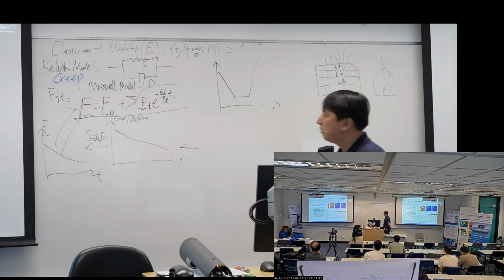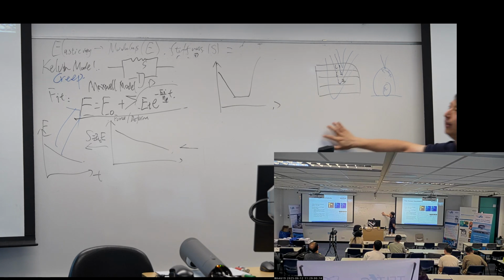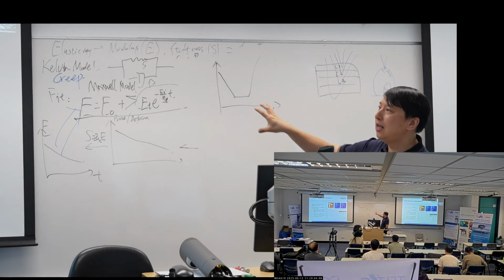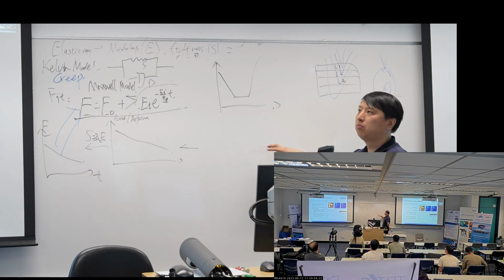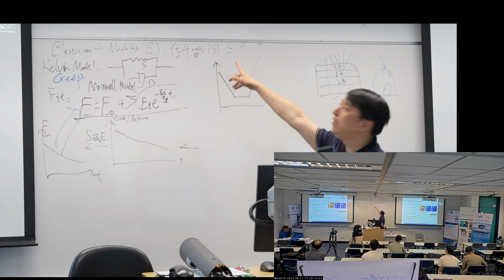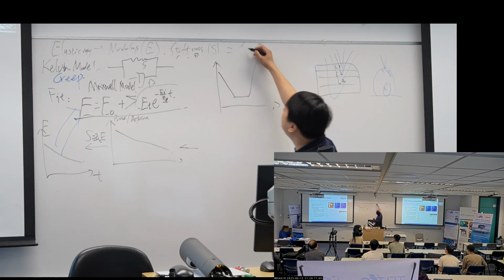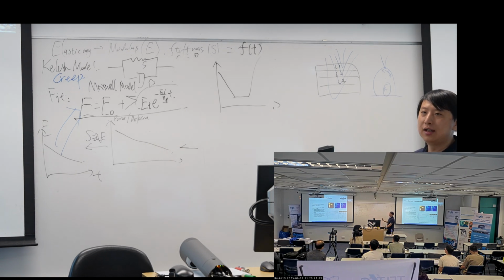Okay, so that's about our topic today, to give a description of the viscoelasticity. From today's setup, we study the viscoelasticity following its definition. We just want to get the modulus or stiffness as a function of time, so we measure them against time to see how it changes.